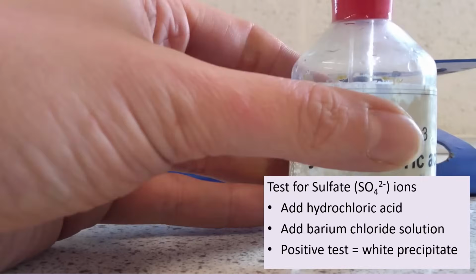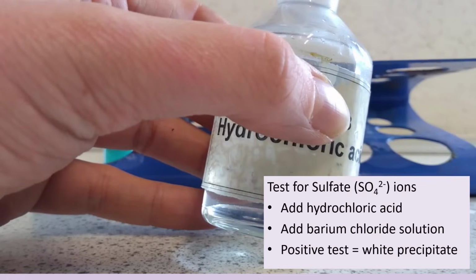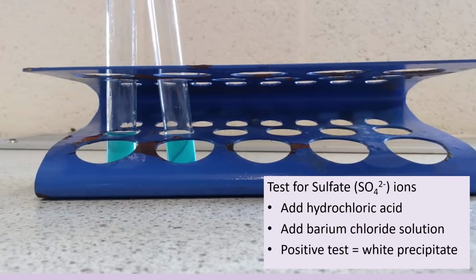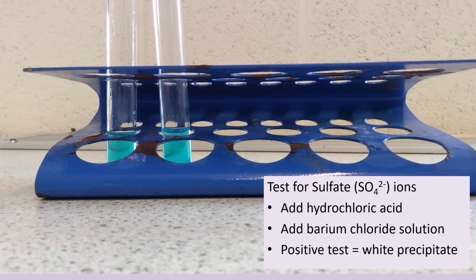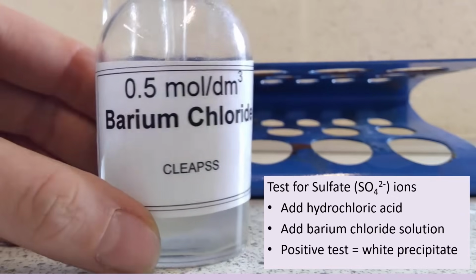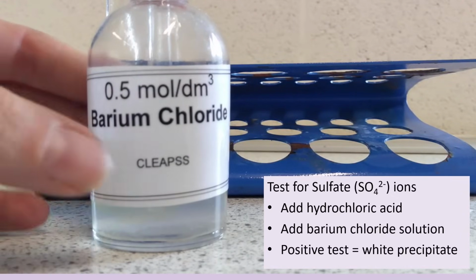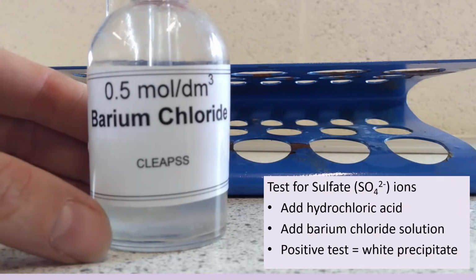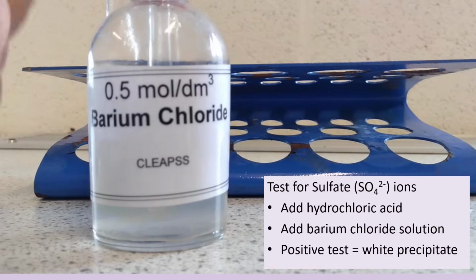So to start with, I'm going to add a little bit of hydrochloric acid to each tube. And now I'm going to add some barium chloride. And the barium chloride, if there are sulfate ions present, then the barium ions will join up with those sulfate ions to make barium sulfate, which is a white insoluble precipitate. So I'm going to see the solution produce this white precipitate and go slightly cloudy.